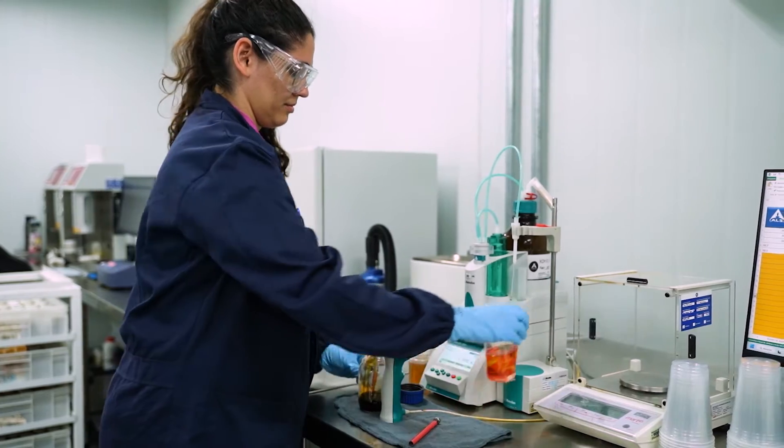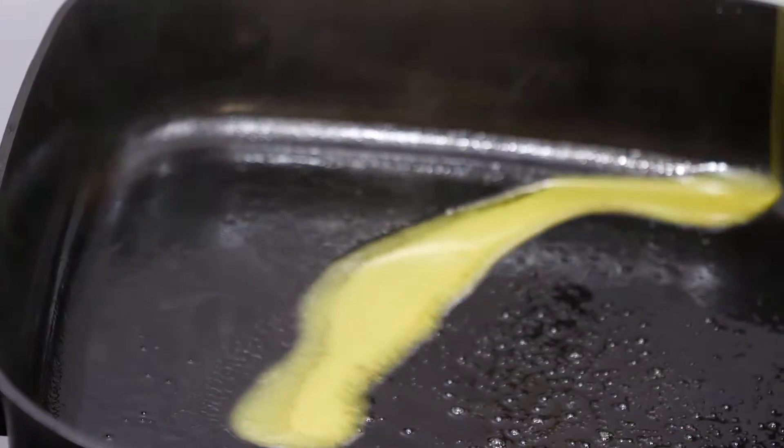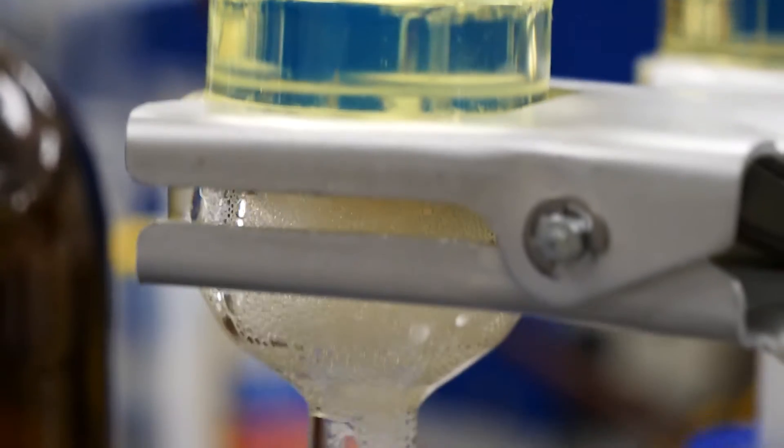It is proven to be a valuable diagnostic tool as well as a means to understanding the integrity of equipment and the oil in service.